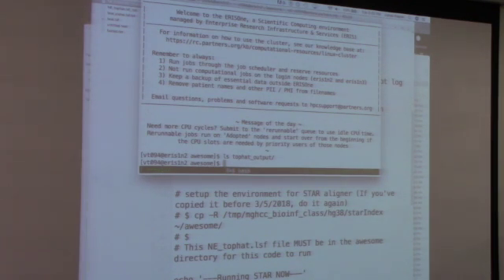Is it because I'm using top hat here and not top hat 2? That's what it is. Because we're loading top hat 2, and I forgot to use receive top hat. Oh, you have to receive. Top hat receive, right, slash here.